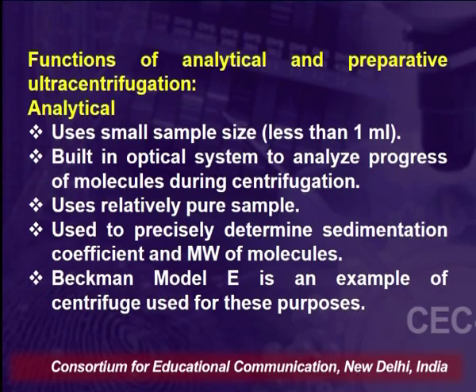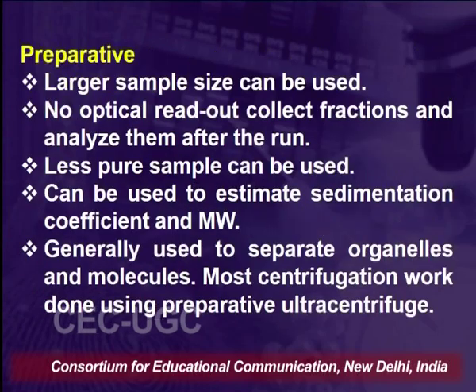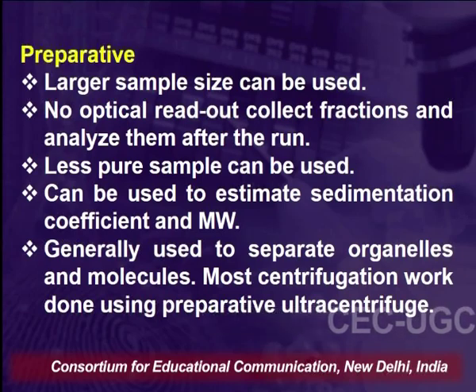Whereas, if we go to the functions of the preparative centrifuges, a larger sample size can be used. This does not have any optical readout system.